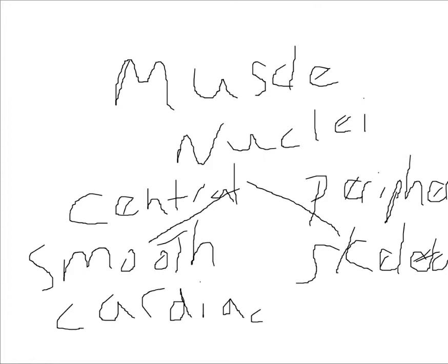All right, so B is cardiac because of the disc. Good. Now, there always tends to be some exceptions. Good, so we have that correct here. Smooth is always mononucleated, and skeletal is multinucleated, kind of as the framework. This is one where we can see the cardiac being binucleated, but that's where we use other features to distinguish things. You might see discs in between the cardiac, but skeletal is the one there. Good question. Really multinucleated. Again, if we pull up that last picture, intercalated disc.